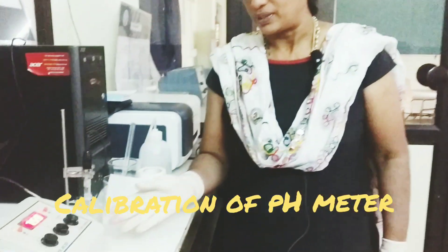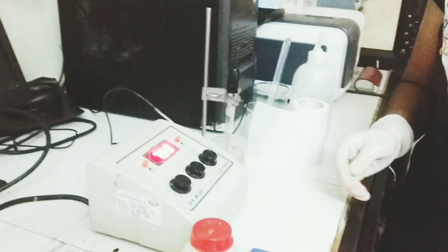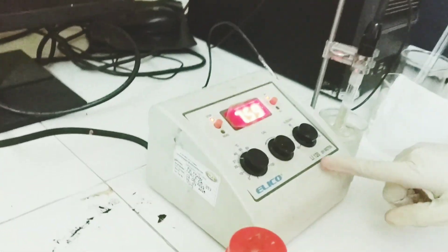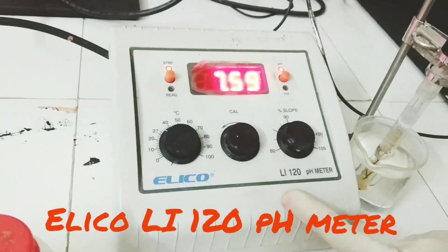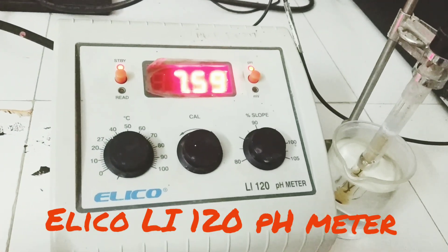Here in our Maharaja's College of Pharmacy, we have the ELICO LI120 pH meter. The model name is ELICO and the model number is LI120 pH meter.